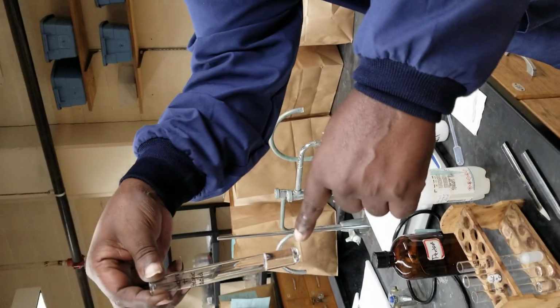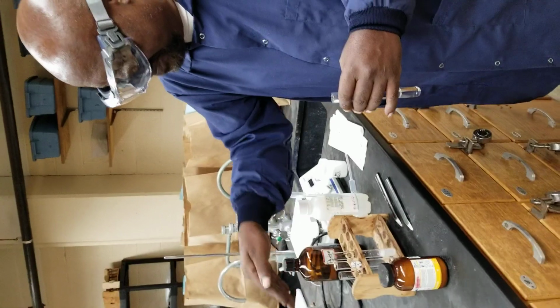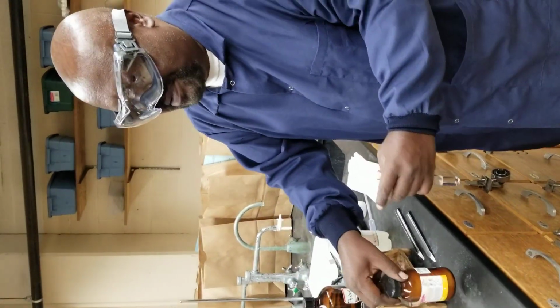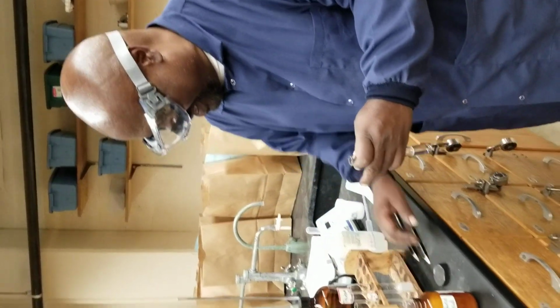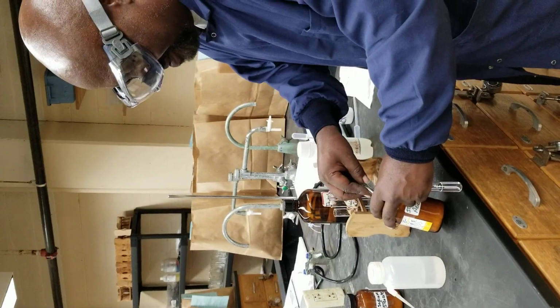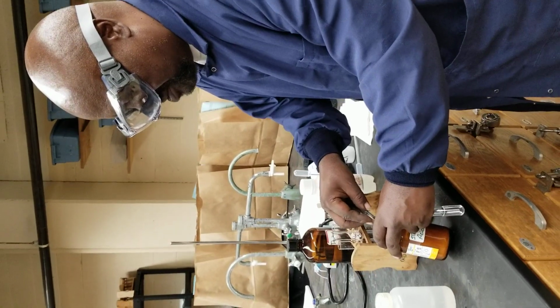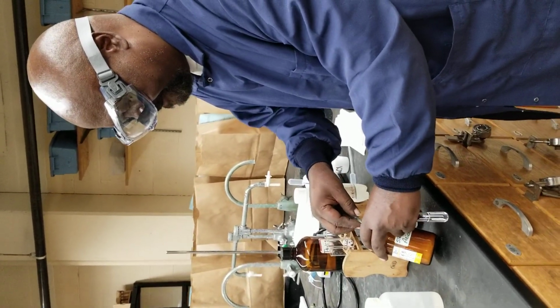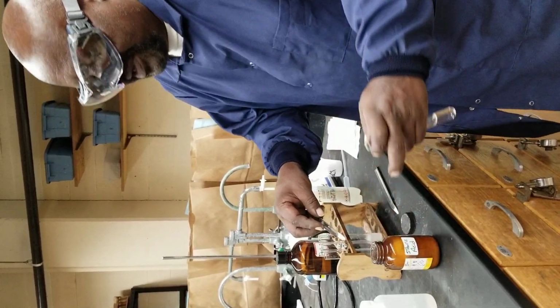Stearic acid in water. What's the difference? Sodium stearate, stearic acid. Look it up in the formula. One of them is molecular with an acid group, and the other one is ionic. Man, picking up a big chunk. I don't want that. Either too much or too little. There we go.